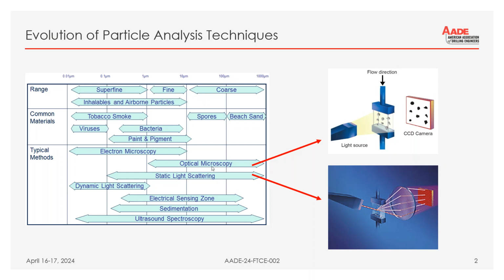So, laser diffraction, I think everyone is pretty much familiar with what that does. Many people here are using laser diffraction. It seems to be the most common method. It's an excellent method. It's been around for a long time. The way laser diffraction works is it takes a laser and shines it onto a particle, and the light is diffracted from the particle. There are a lot of other intricacies involved if the particles are smaller and translucent, but for the most part, laser diffraction is just measuring the angular data of diffracted light from a particle.